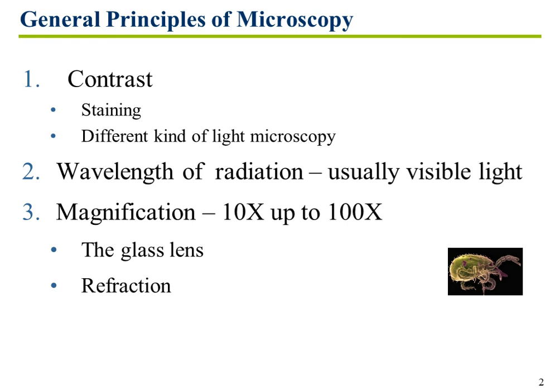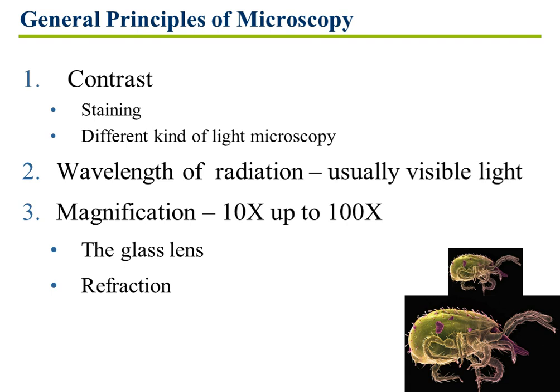That is called magnification. And the little object, you're looking at a color-enhanced electron micrograph of a dust mite over on the right. And obviously he's very small, so if you wanted to see more, you'd make him bigger. And when you magnify, now you can really see a lot of cool detail like hairs on his legs and little purple, I don't know, dust particles or whatever on his back and so on that you couldn't see in the little one.